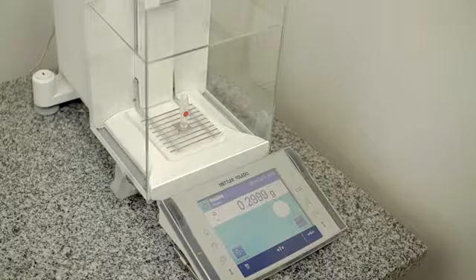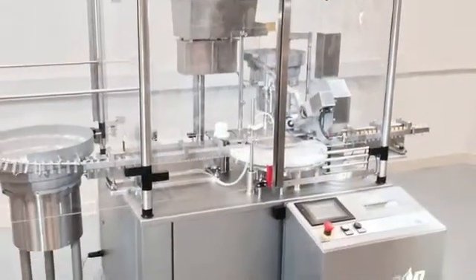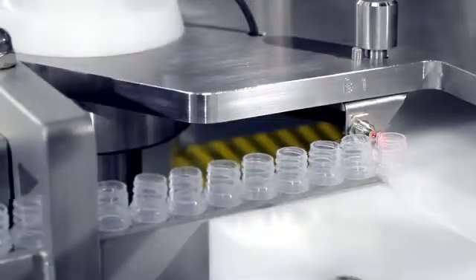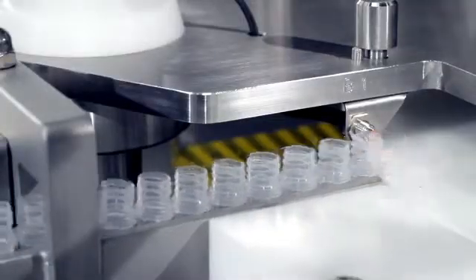The filling and capping line is very compact, configured using standard modules and proven technology. Installation is straightforward, requiring no special access as it can enter a door with a width of just one meter.